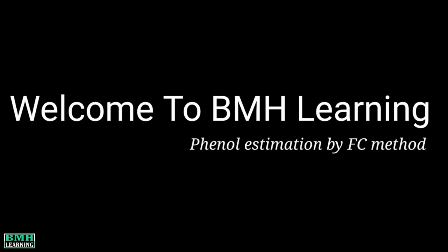In this video, we are going to discuss phenol estimation by the FC method. So in this tutorial, we will be talking about how phenols can be quantified using the Folin-Ciocalteu method.